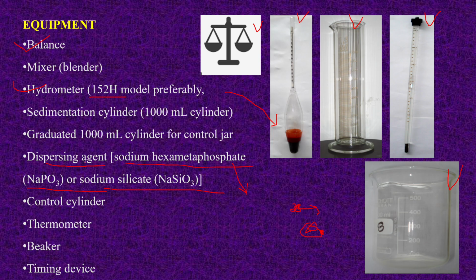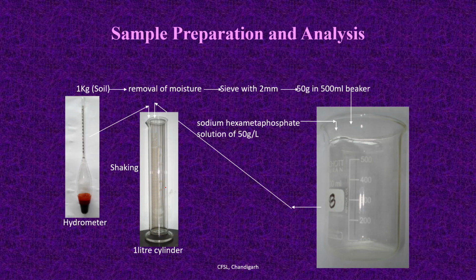So sodium hexametaphosphate will separate the sand particle and the clay particle. This is the work of the dispersing agent.